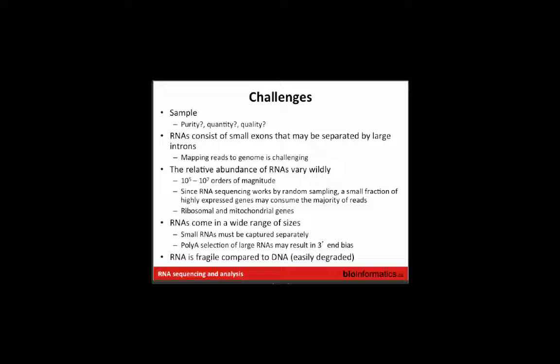Yeah, so that's a really great question or point that you raised. There are a number of wet lab strategies that attempt to address this problem by normalizing the varying levels, to pull down the really highly expressed things and pull up the lowly expressed things, put them on a more even playing field and even out the number of copies for each. And there are quite a number of strategies that have been used over the years.